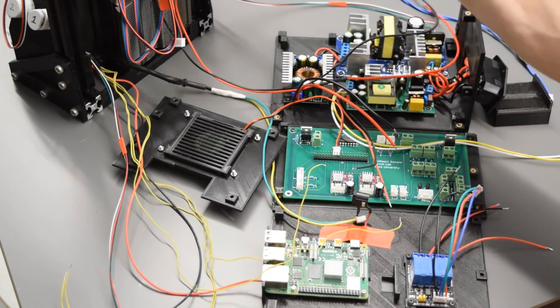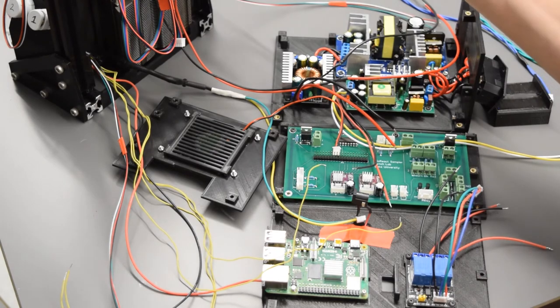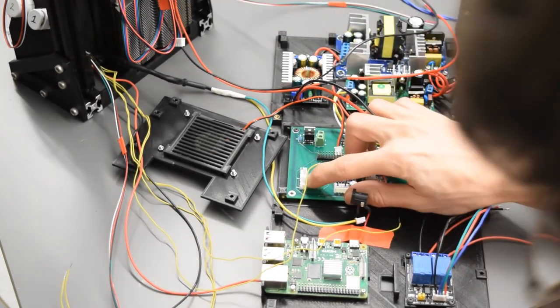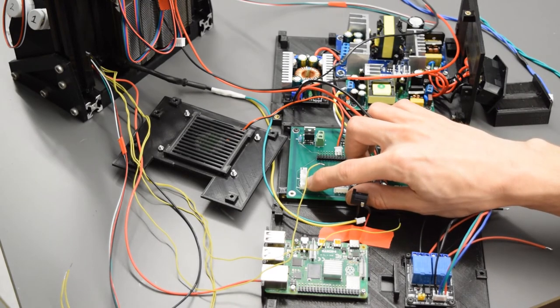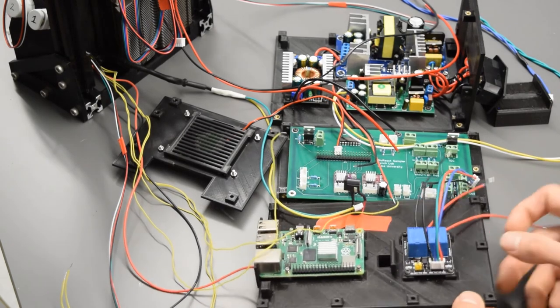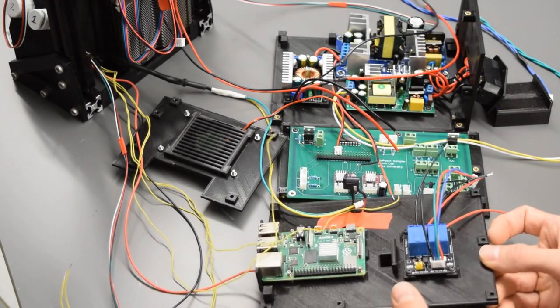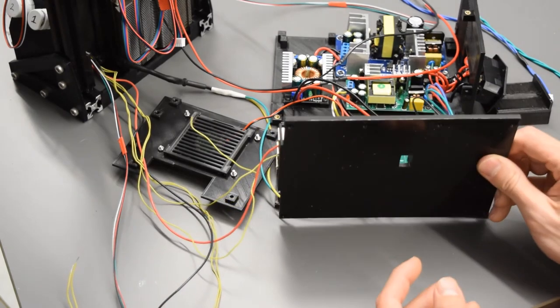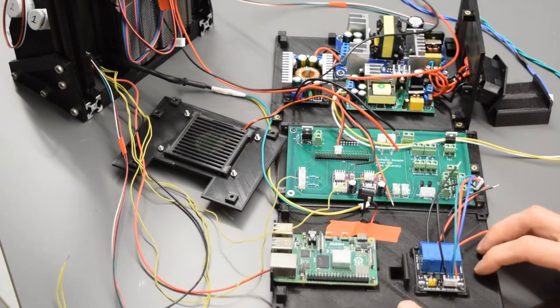The end stop switch, the 3-pin, we can also plug in over here on the side. And it also has a directionality with the red wire going to the bottom pin here. Those should all be coming in through the back wall here. So lastly, you're going to close up the back, but we're probably going to wait a second to do that one.